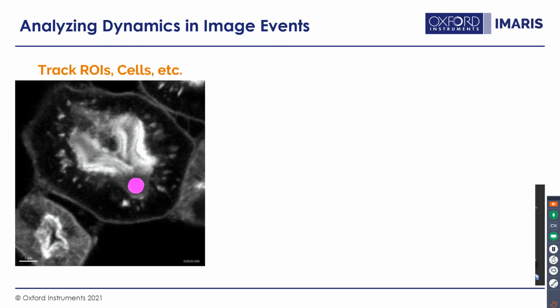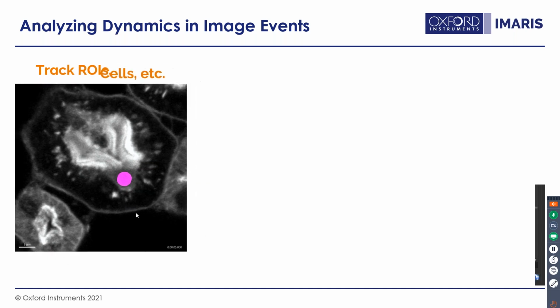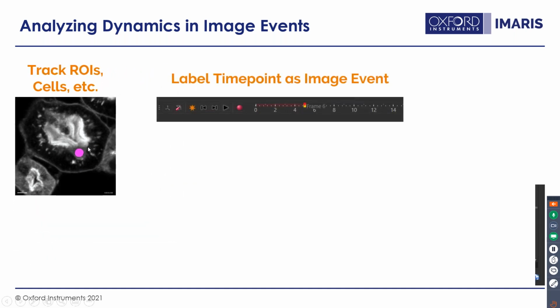This image is a case where we do have bleaching. What you're seeing is that in this little region, in the beginning, it had lots of signal, like the rest of this tissue in here. A bleaching happened right here.